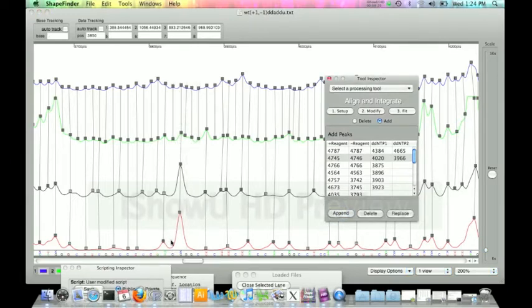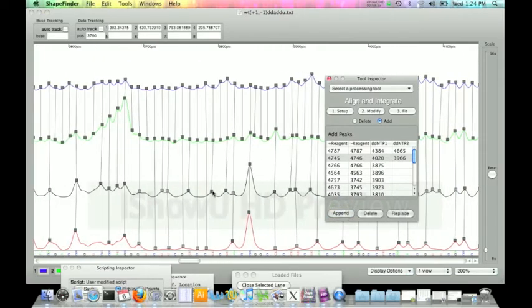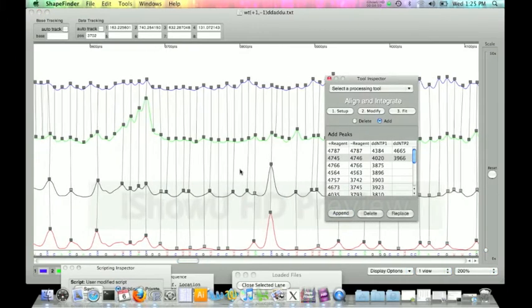Boom, there we go. Our A lines up with our A peak. Our U lines up with our U peak. We can click on these just to confirm them. Beautiful. All right, again, we're still going down. We still see a good alignment. We have our U's, our U. And sometimes it doesn't get it on the first try. Again, we have a U right here, no problem, still lined up, looking good.